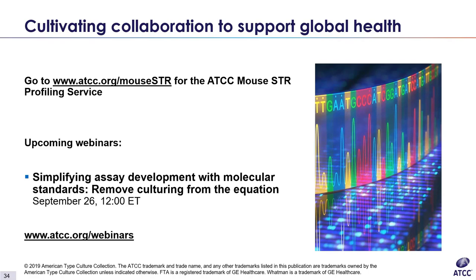We've got another question here. It says, in humans, 3 peaks at 3 loci are indicative of contamination. Does the same standard hold true for the mouse loci? Right, I can answer that one. Not necessarily. 3 peaks at 3 loci when you're doing forensic analysis and STR profiling individuals does mean contamination for sure. But when you're doing cell culture, some cell lines do exhibit MSI, which is microsatellite instability. So you can get more than 2 alleles at a locus in a human cell culture. This is actually quite common, especially in tumor cancer cell lines, and this is seen in mouse STR as well.